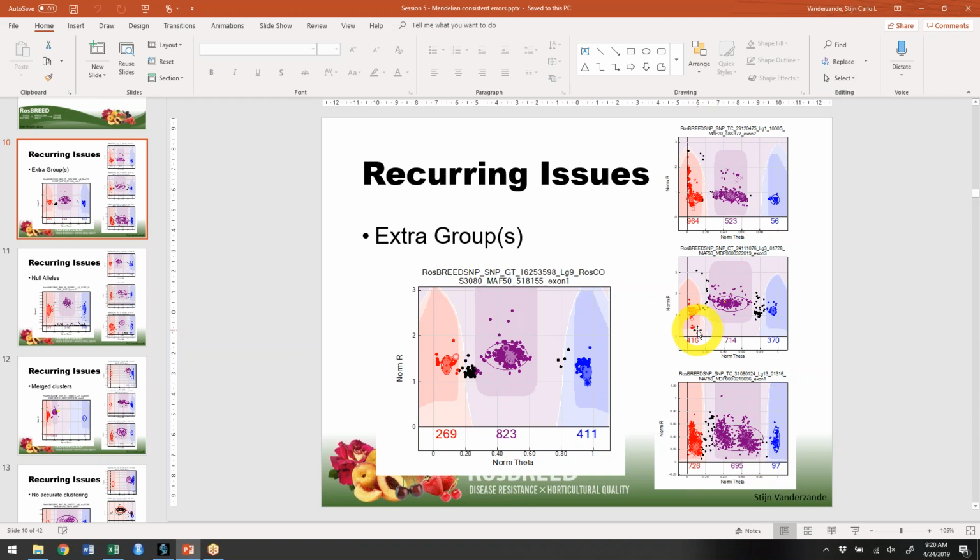It might also be that you think you figured it out, that you run FlexQTL again, and that you find more errors, and that you didn't. And maybe you had two hypotheses and you can test the second one, but after that, if you still don't find it, then it might be time to remove that SNP from your data set.